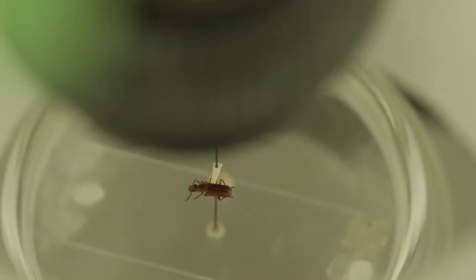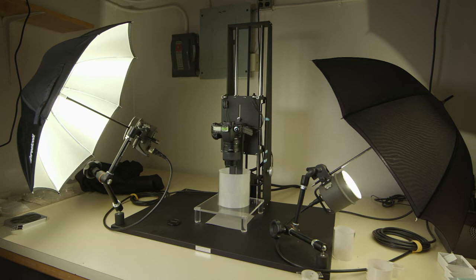One of the issues with macro photography is that very little of the image is actually in focus. What the Visionary Digital System does is take a series of images — we call them image slices — through the specimen.